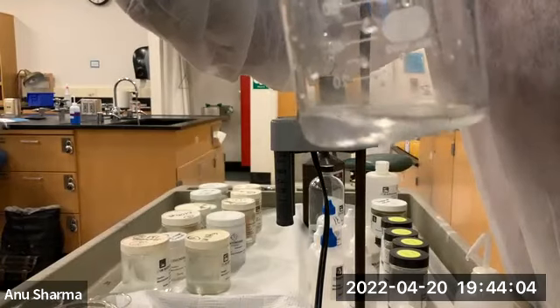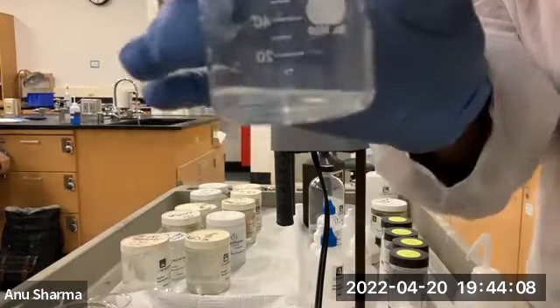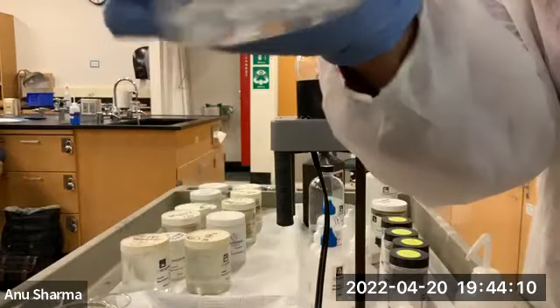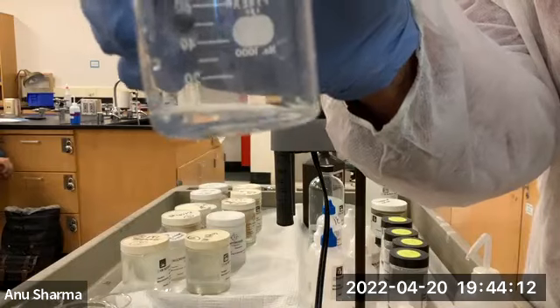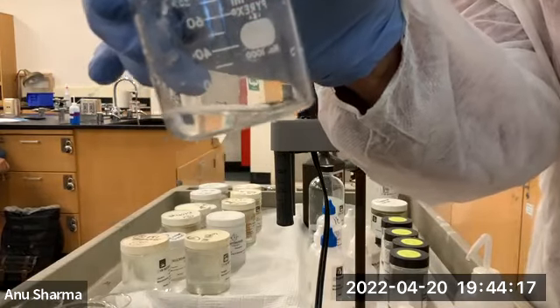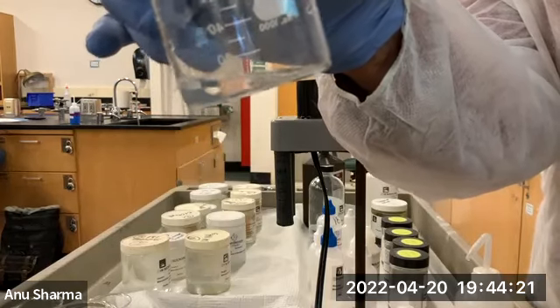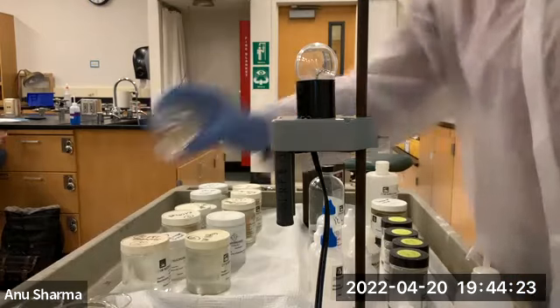It shows a little bit of milkiness, but it's really the hydrogen bonding happening. But it is still clean and clear. It is soluble in water. You see the light can pass through. It's a clear solution. All right, guys, so that's the deal with acetone.